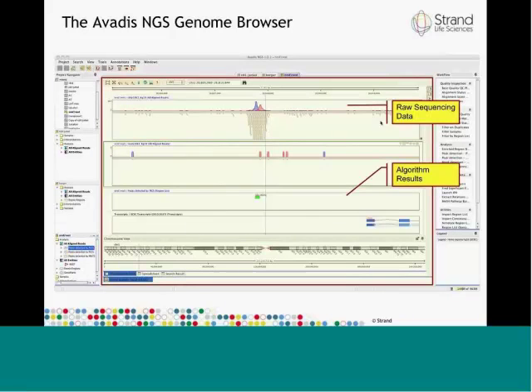The next track shows the result of an analysis step, in this case the peak finding algorithm. The small green colored region that you see at the center of this track is the detected peak region with a score of some 350 odd. The last track shows public annotations. In this case, it shows UCSC transcripts, and you can see a gene close to this peak that has been found by the algorithm.